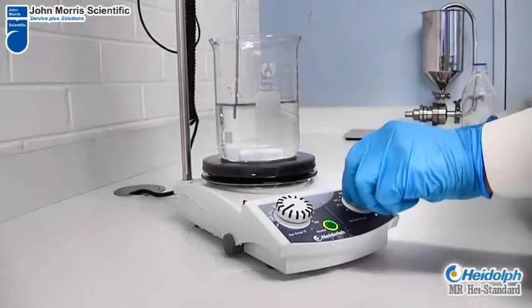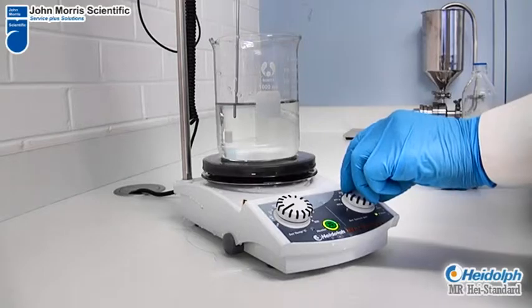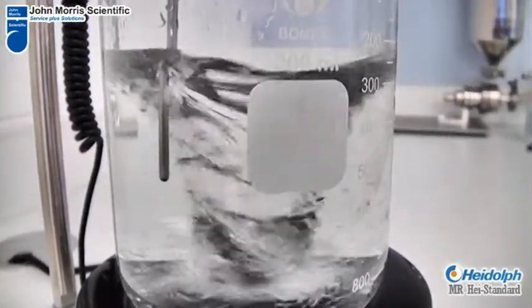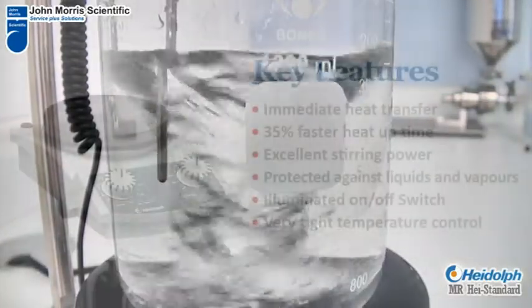Additionally, the heating capacity of 800 watts combined with the Kira disc coating provides 35% faster heat up times compared to other major brands. All these features make the Haidoff MR series hot plate stirrers perfect for your needs.